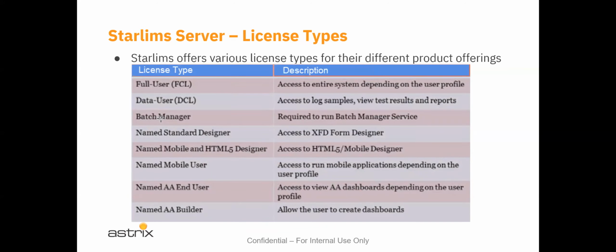So as consultants, we're going to be asked to go into STARLIMS systems and modify functionality or add new functionality or fix broken issues. It might be the specific component of an out-of-the-box component isn't working the way they designed it to work, or it needs to be working, etc. You need a specific type of license to do that, to go in and be a designer in STARLIMS.